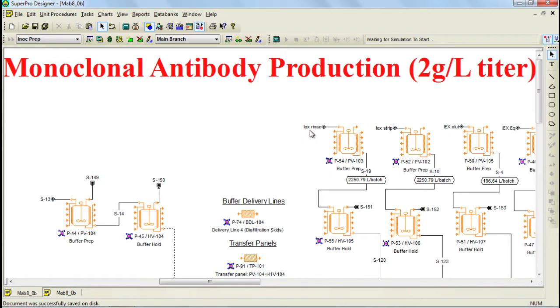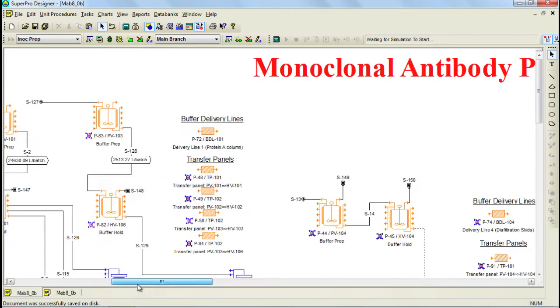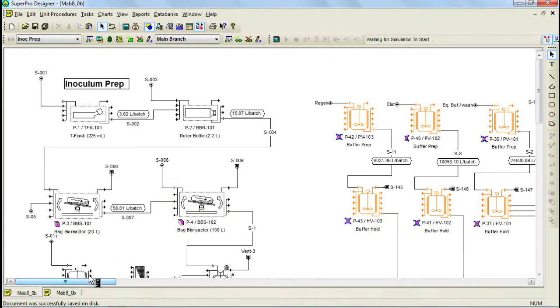The example at hand analyzes the production of a therapeutic monoclonal antibody using animal cell culture and not only includes the main processing steps, but also support activities such as buffer preparation and holding, delivery lines and transfer panels. Let's begin with the upstream processing steps of this process. In order to simplify the process, the model has been divided into sections and each of them is displayed with a different color.